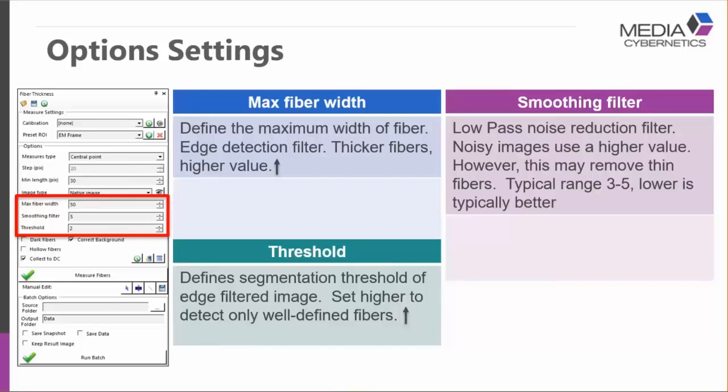If you have very thin fibers and maybe they're bending, curling back, not all nice, neat, and straight fibers, this prevents it from over measuring your fibers. So if you have something that's bent back on each other, and the fiber is only 0.5 microns, and you have two fibers that are folded over each other, by setting that limit, you prevent it from measuring basically those crossed over fibers as a single fiber.